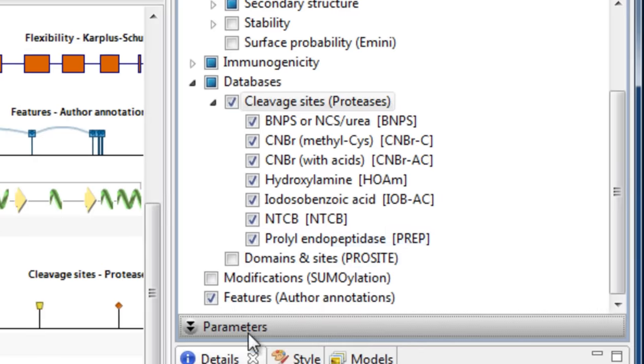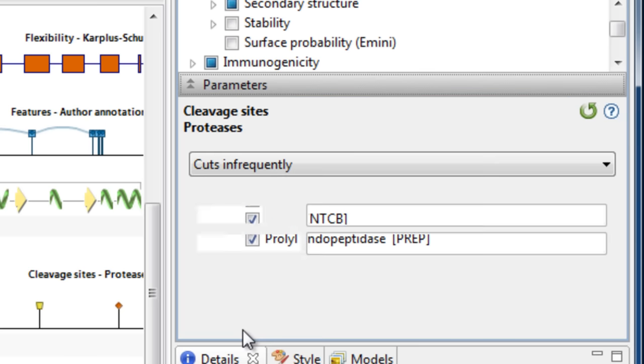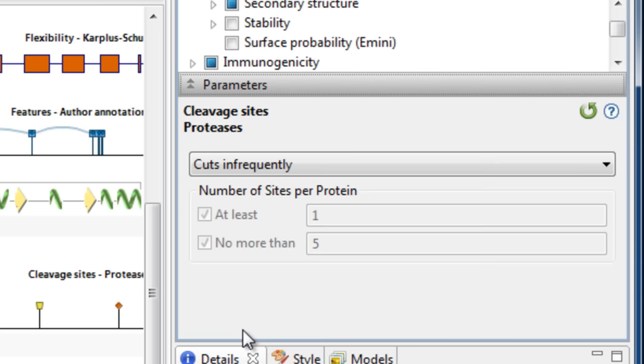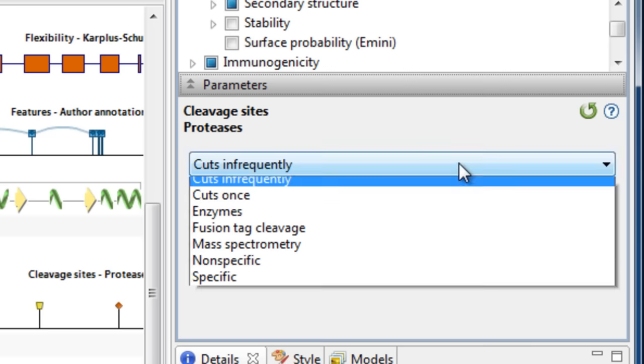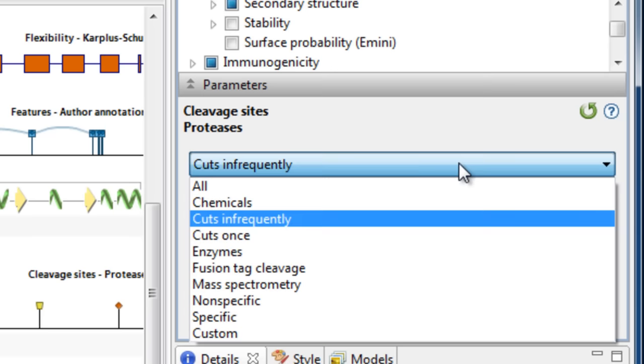Expanding the Parameters panel allows you to filter based on the type of protease or number of cleavage sites. Select your specific filter from the dropdown menu.